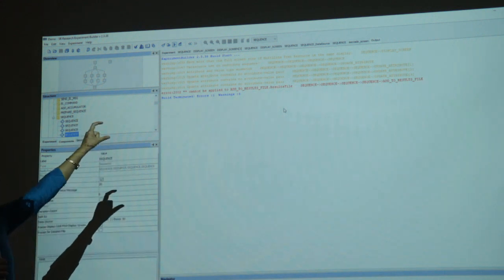So the thing about the test running here is we will get to this little bit in the demo when we are running the experiments, but I will just go through quickly. When you do the test run, it shows you some in orange and some in red. The ones in orange are just warnings. It doesn't mean that your experiment will not run without them. It just means that it is missing some little details that could make it clearer and finer. But the red ones are errors that need to be fixed. If you don't fix those errors, the experiment will not run.